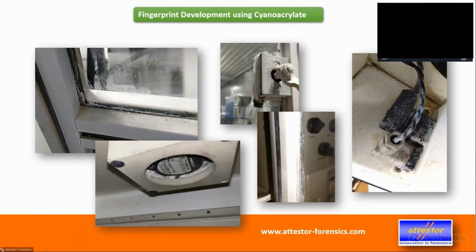So if you look at those cabinets, apart from rubber seals in niches and so on, you would also have this kind of aluminum bar with, what do you call that? Slits? Yeah, rubber seals and slits, yeah. Like where you usually put mounting brackets in and stuff like that. You'll have systems like locks that go inside the system that look like this one. You have free hanging cabling and wiring. And yes, you can clean that, but it's an awkward activity, and no one really likes to do that.